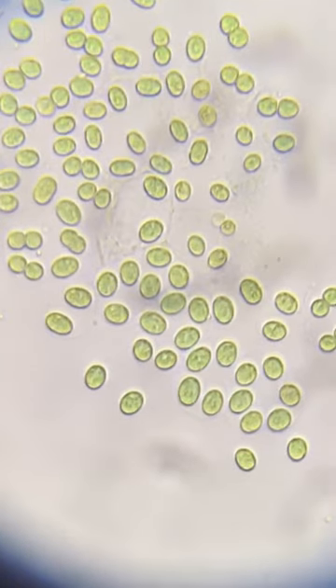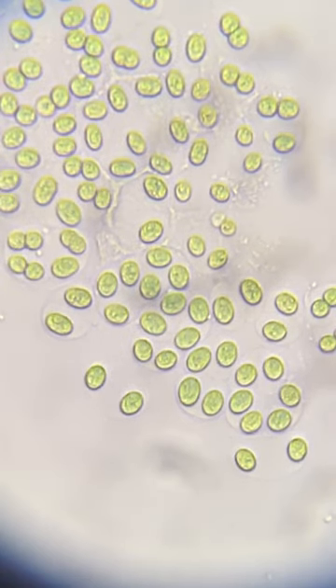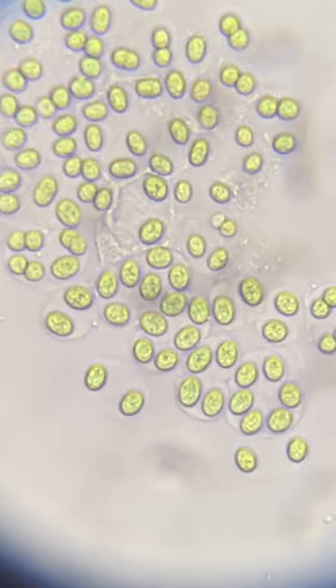This is Gloeocapsa species. You'll see that there are these vegetative cells that have a green color to them inside of a gelatinous sheath. Some of it has like two cells inside of the gelatinous sheath, and some have more like four or five or six cells inside of that sheath.